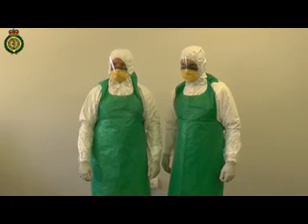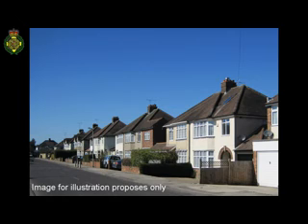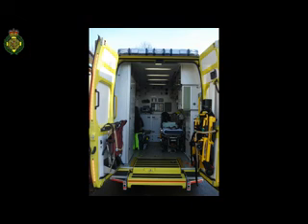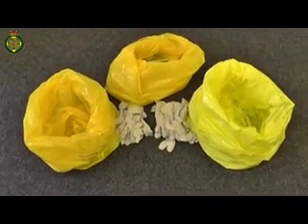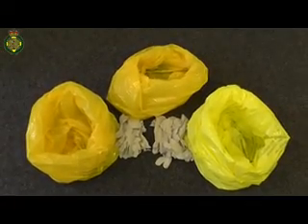First, a clean officer needs to set up the scene. This needs to be in a safe environment such as outside the patient's address, outside A&E, or outside the back of an ambulance. For a crew to disrobe, you will need 6 clinical heavy-duty large waste bags to make 2 double bags, a single bag in the middle, and a spare.